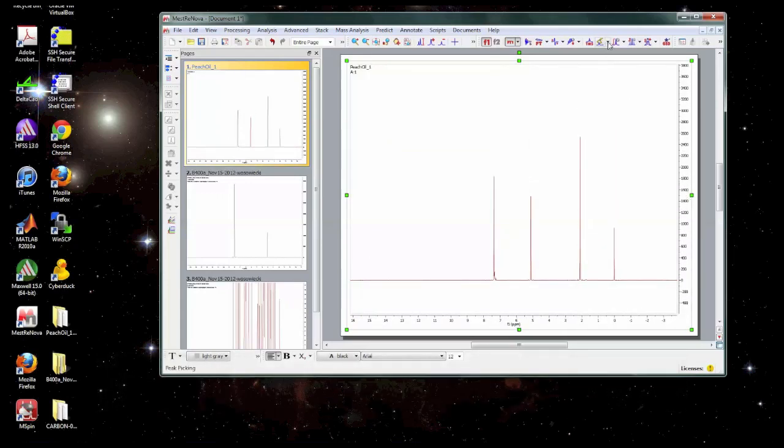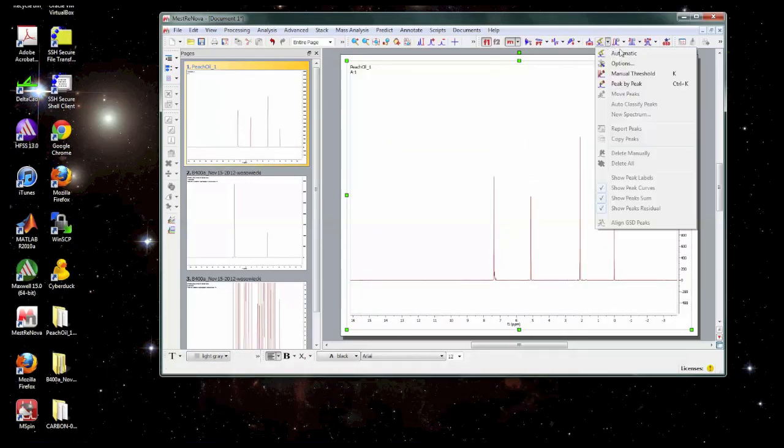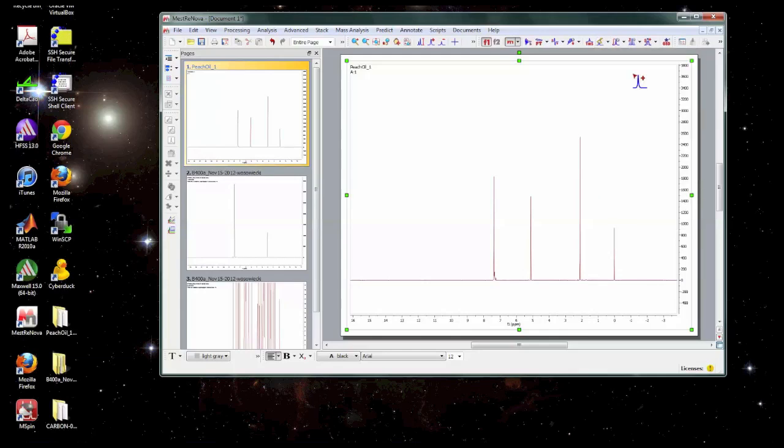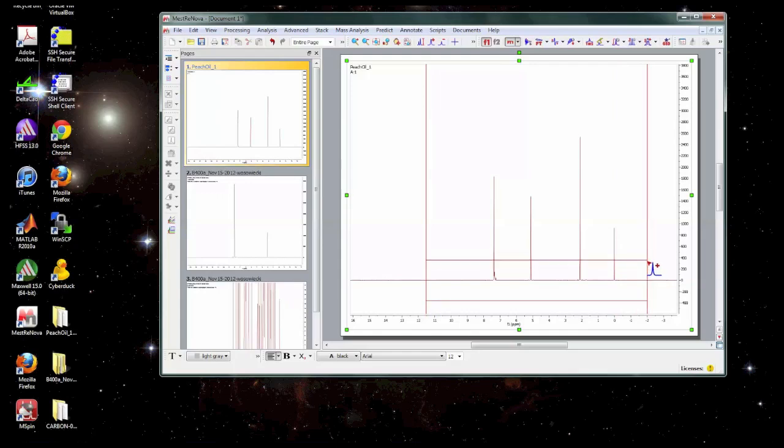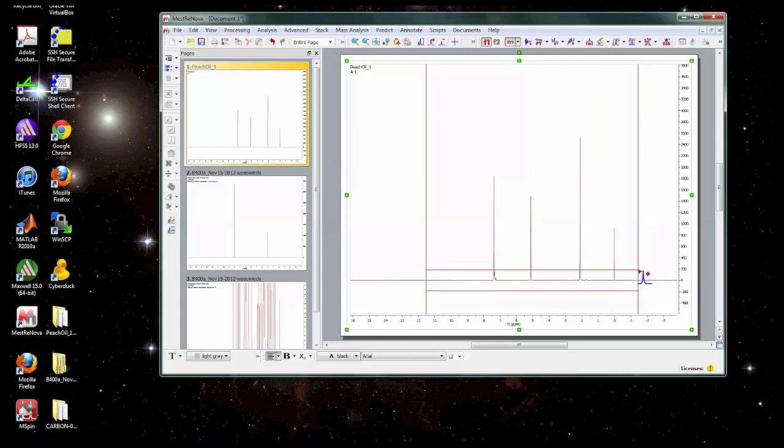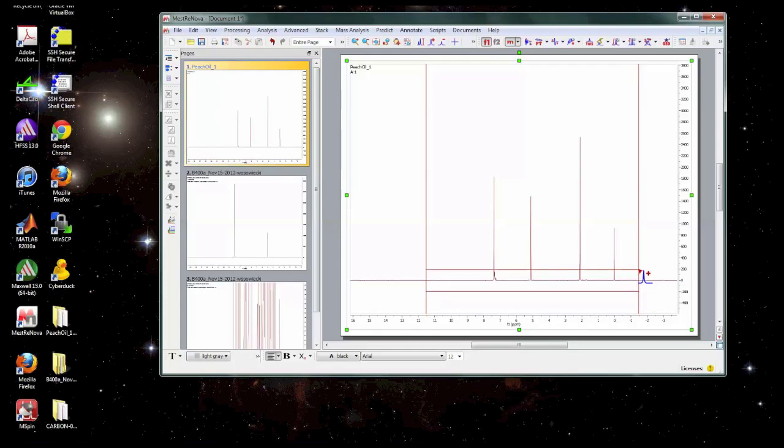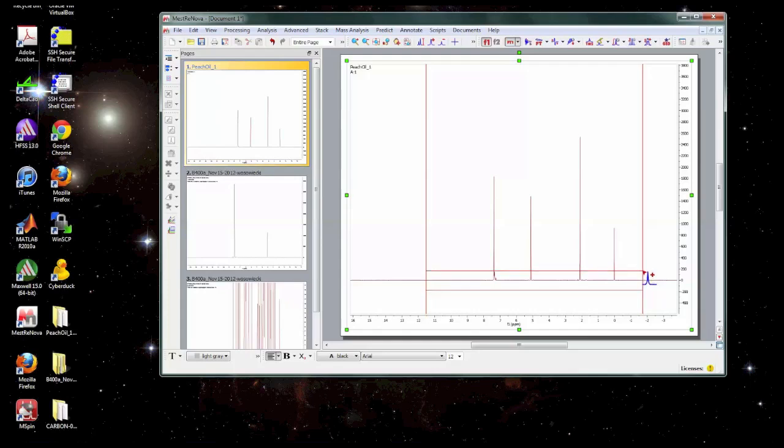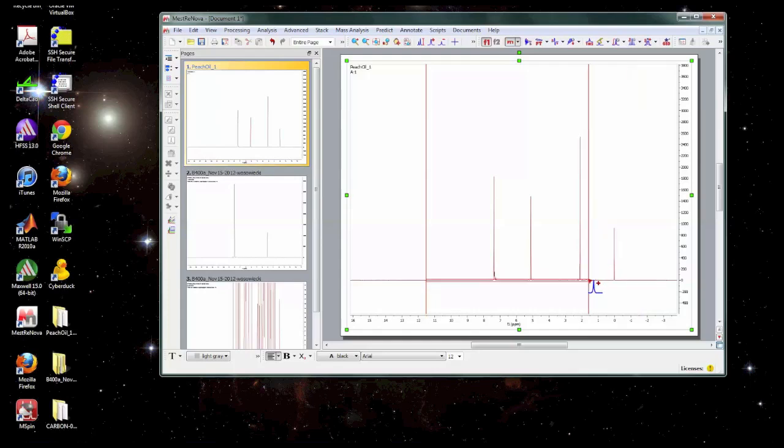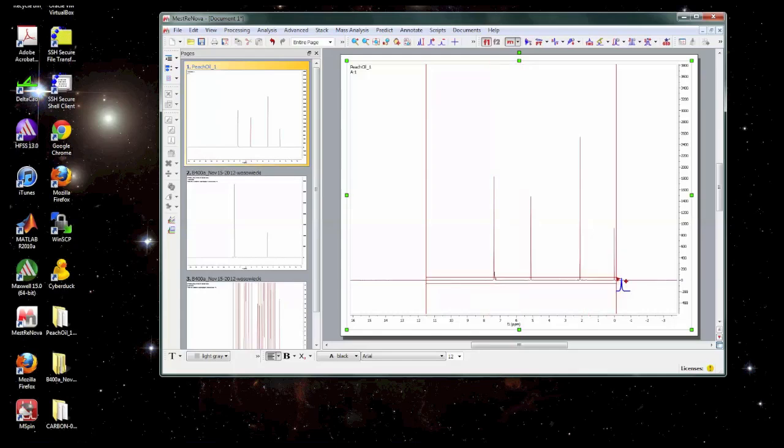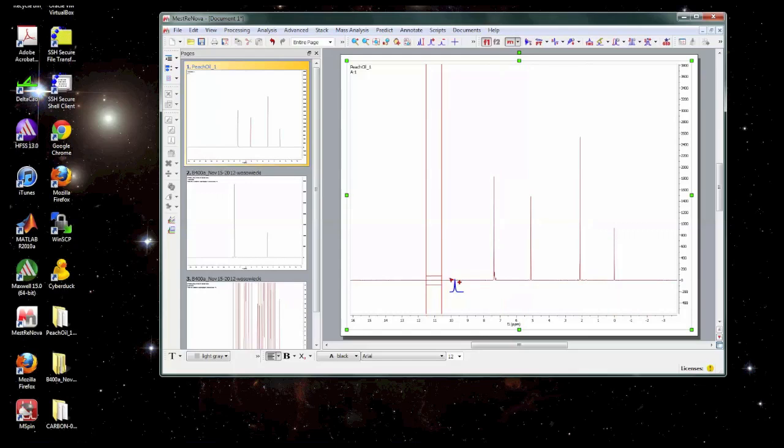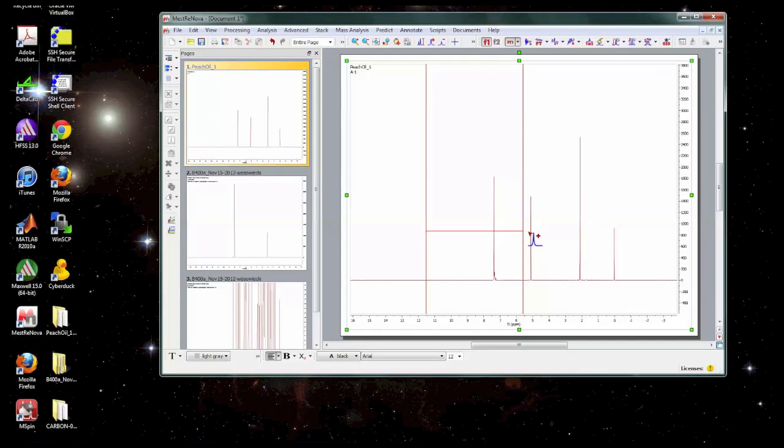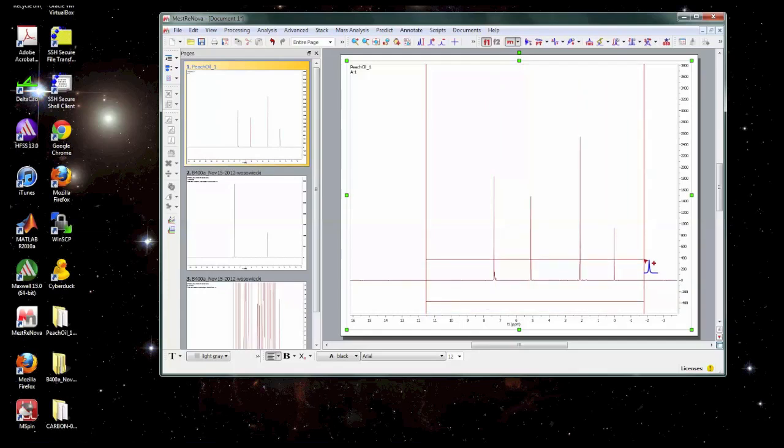Next thing we can do is peak picking. Now automatic may work reasonably well. But a reasonable way to do it is the manual threshold. What we do is select the manual threshold. And we're going to draw a line. And everything above or below the line, if you had negative peaks, will be selected as a peak. Anything that is inside these two lines here will be ignored and considered either a minor peak that you don't care about or part of the baseline. Because if you had too much here, you could have thousands and thousands of peaks. And that would not be very easy to interpret. We just want to focus on these main peaks here. So we're going to set threshold so that we just pick the main peaks.